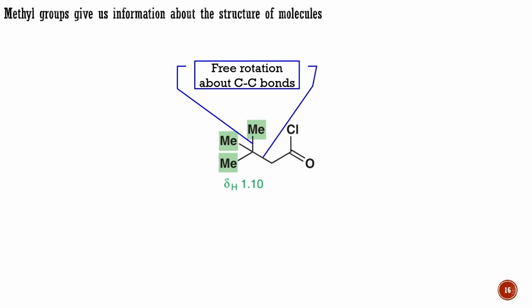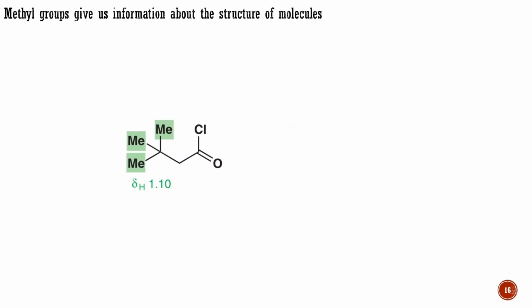Although at any one instant the hydrogen atoms in one methyl group, or the methyl groups in the tert-butyl group, may differ, on average they are the same. The time averaging process is fast rotation about a sigma bond. The second compound shows 2 signals for the methyl groups, one at 1.99 and one at 2.17 ppm. Unlike a carbon-carbon single bond, the carbon-carbon double bond does not rotate at all, and so the 2 methyl groups are different. One is fixed on the same side of the alkene as the acid chloride group, while the other is fixed on the opposite side.